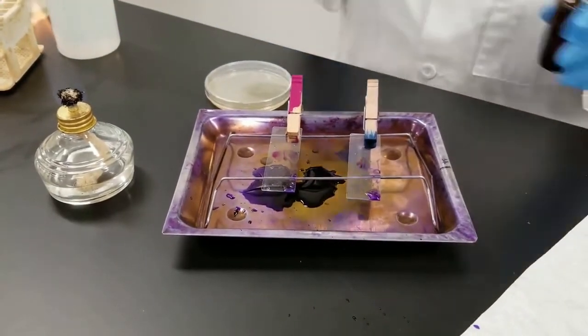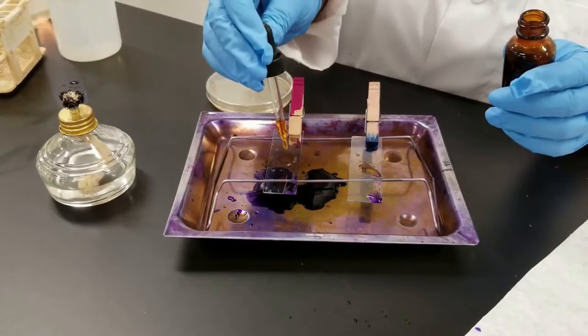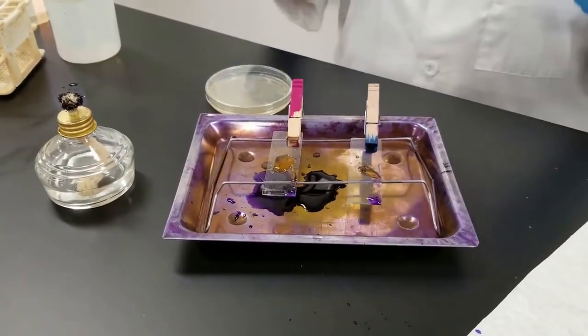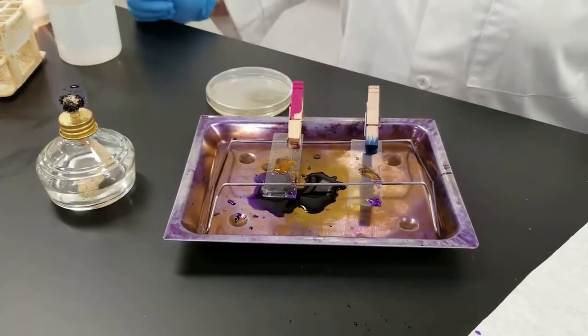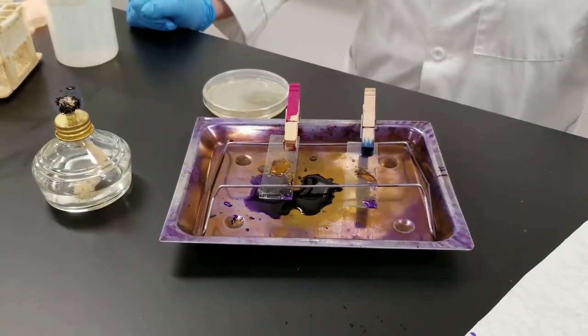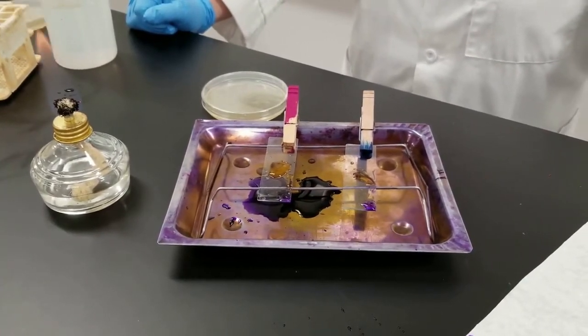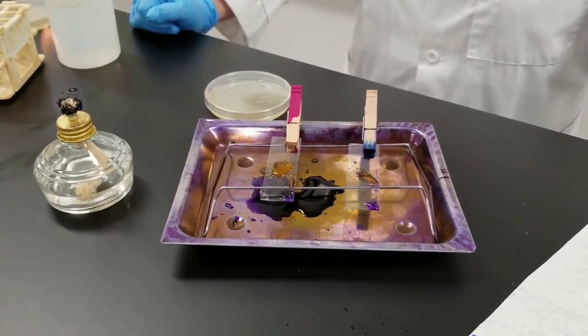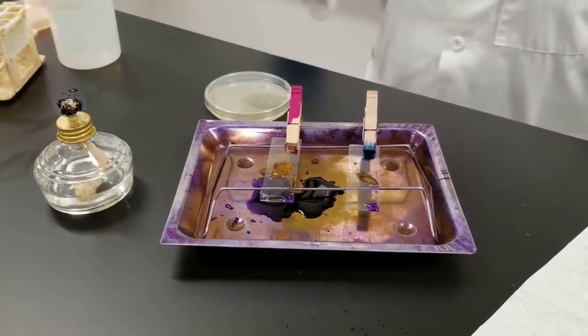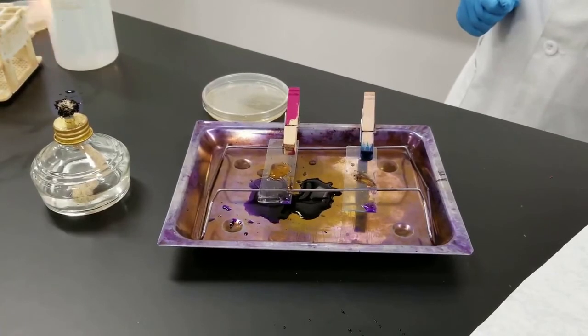Now, the second step is to add Gram's iodine. So I'm just going to flood the area with that, and that stays on for one minute as well. This is a mordant. It's going to help fix that Crystal Violet and help it stabilize in the cell wall. So I say that the cell wall is different between two major classifications of bacteria. The gram-positives, their cell wall is much thicker than the gram-negative cell wall. The gram-negatives have an extra outer membrane as well, and these differences in the chemical compositions are what make the staining process different in the end. So that iodine will remain on for a minute.